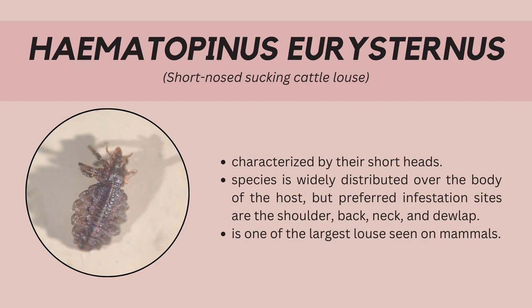The first louse in this video is the short-nosed sucking cattle louse, or Haematopinus eurysternus. Cattle have many lice species that parasitize them, which makes differentiation of different species of utmost importance. Haematopinus eurysternus, or the short-nosed cattle louse, is characterized by its short head. The species is widely distributed over the body of the host, but preferred infestation sites are the shoulder, back, neck, and jowl. To differentiate it from other sucking lice, the shape of the mouthpart is to be observed. It is one of the largest lice currently seen on mammals, at around 4mm in length.